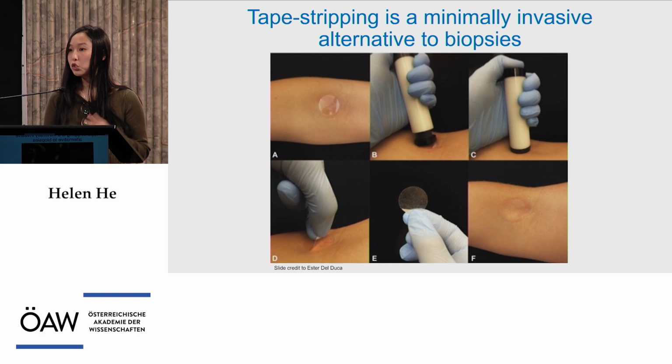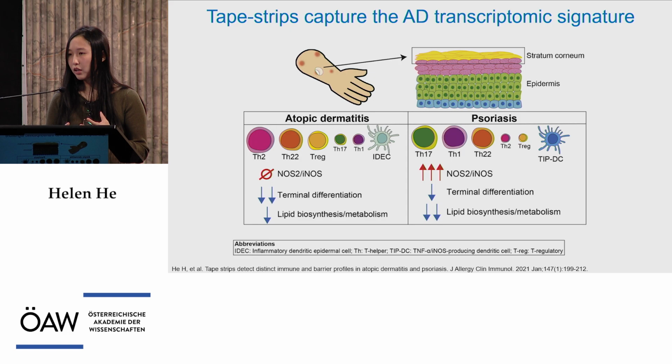They're useful in pediatric populations, and as you can imagine, they would be useful in multi-omics studies as well, where different layers of tapes can be taken from the same patients, and all of these different layers can be analyzed concurrently using different platforms. And we do a lot of tape stripping in our lab.